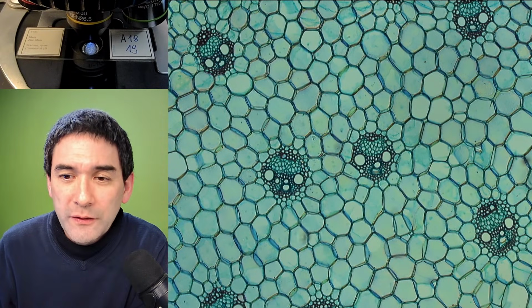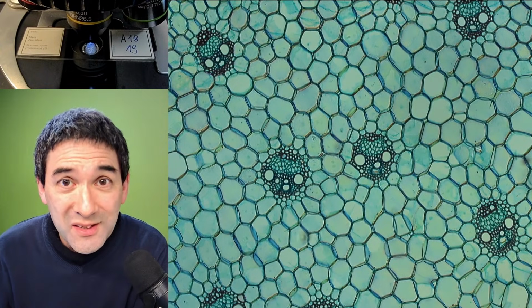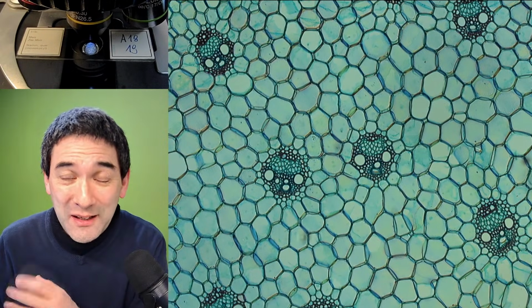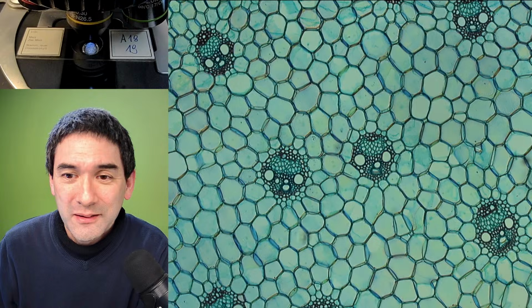It makes dark field a great way to check the cleanliness of a slide before making it permanent. Yes, it does. However, dark field is so sensitive that even the dirt and dust in the optical path, you can see that too. So that's one of the things.